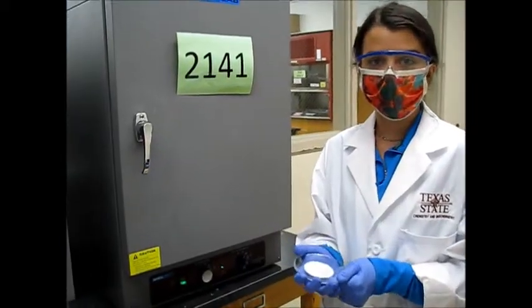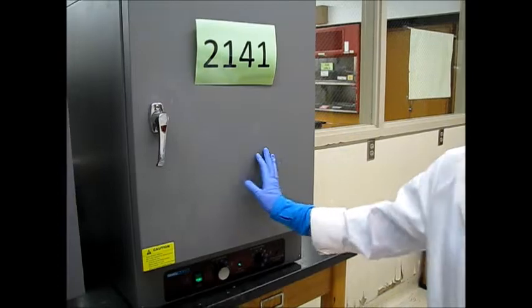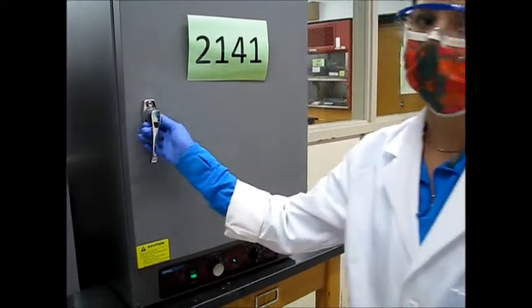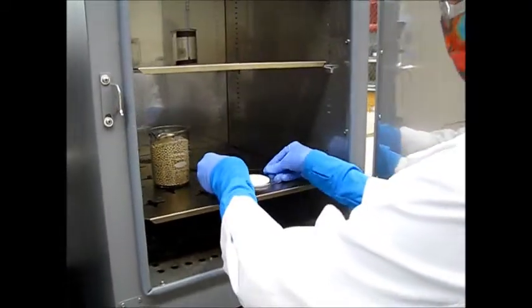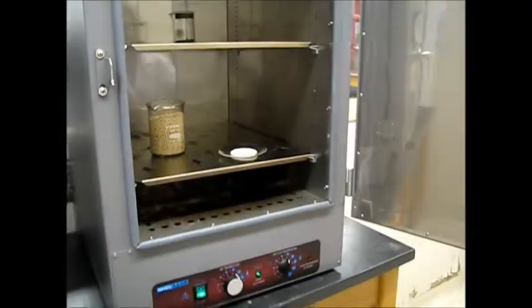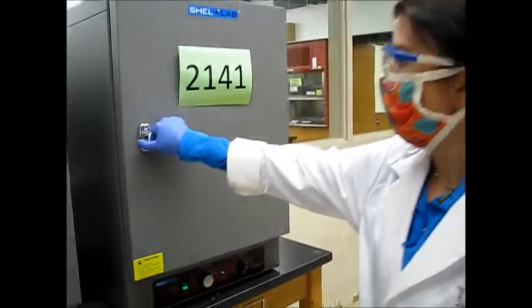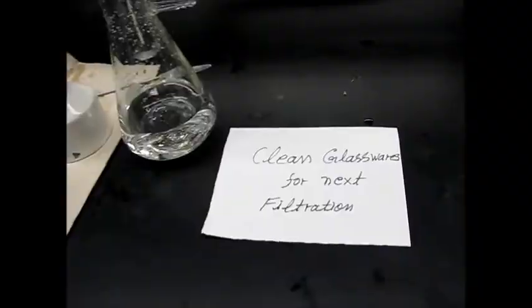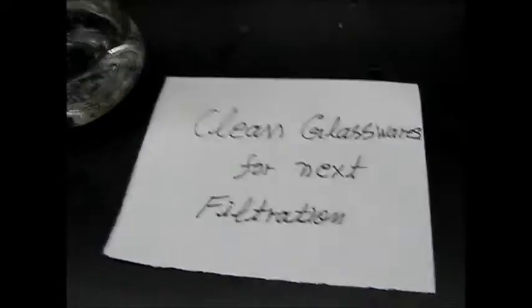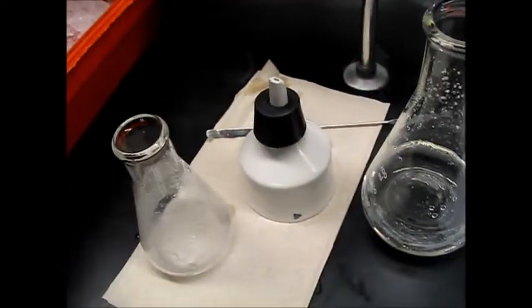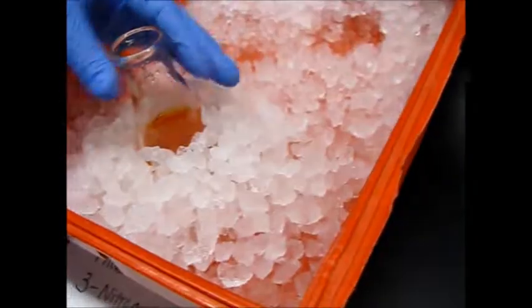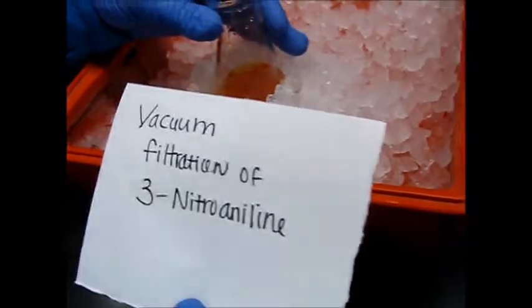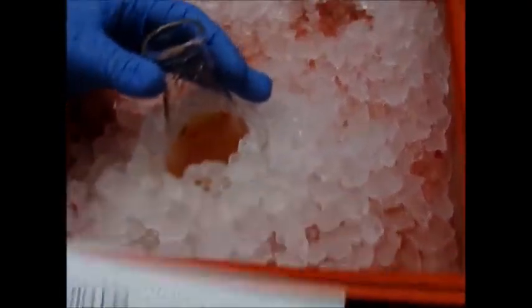Now we will take our benzoic acid filter paper and place it in the oven labeled 2141 which is our lab. Open the handle and place it into one of the divots where it's secure. Come back after 10 minutes and make sure you close it tightly. So now we have to clean all these glass wares, our filtration assembly, for the next step. Next filtration which is our 3-nitroaniline.